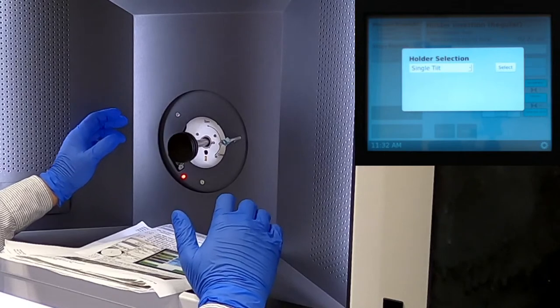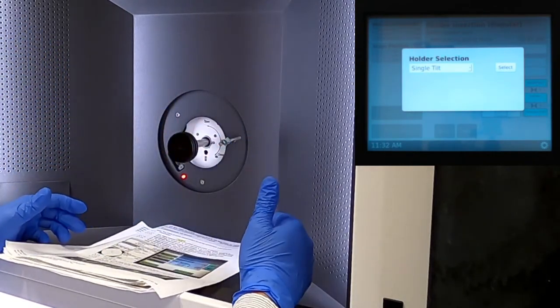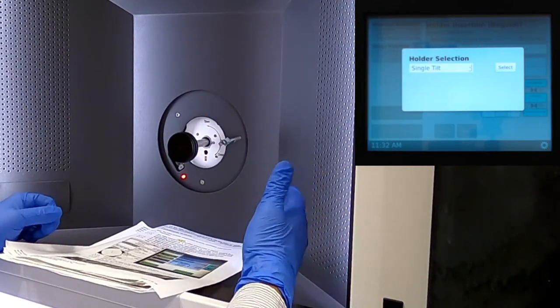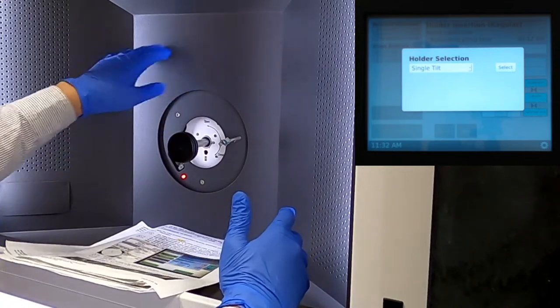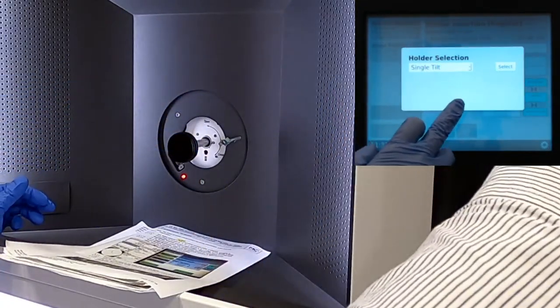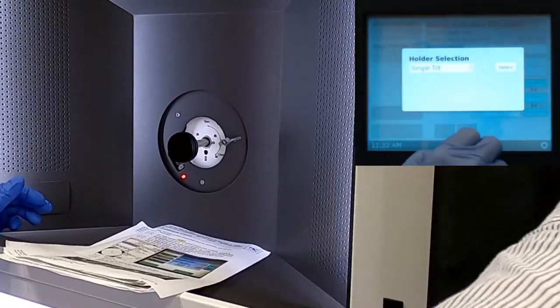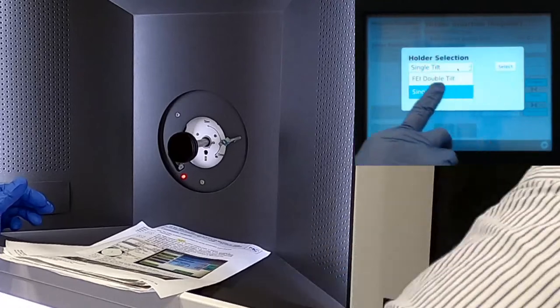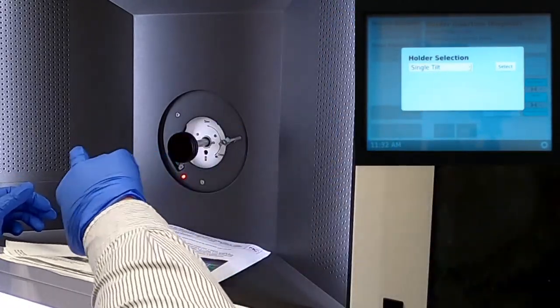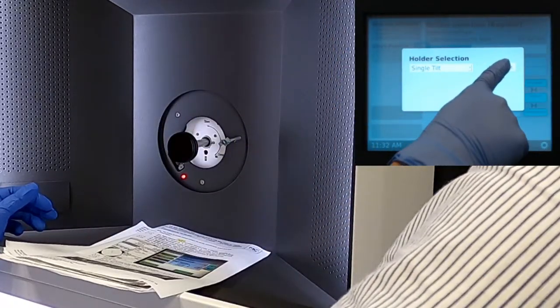Right now you can hear the sound. If not, it doesn't matter. The pump just started, so it's going to pump out the sample loading chamber. On this touch screen, there is a holder insertion dialog. There are only two options, single tilt and double tilt. Because we're using a single tilt holder, you can just select single tilt and click select.